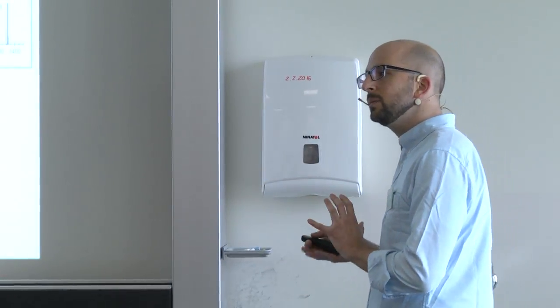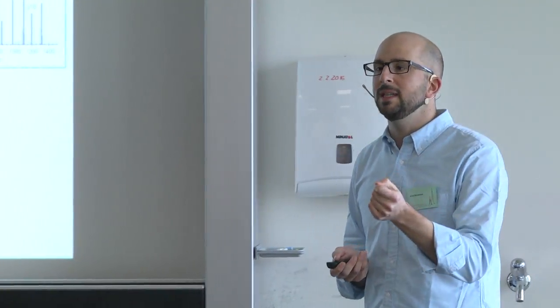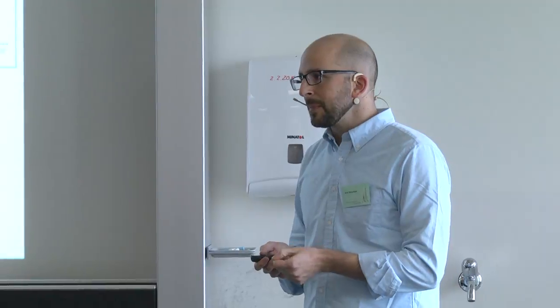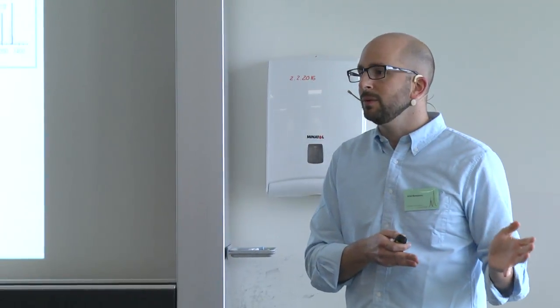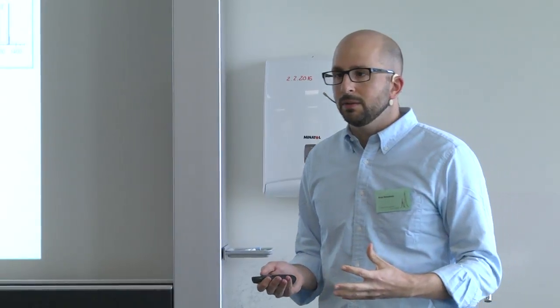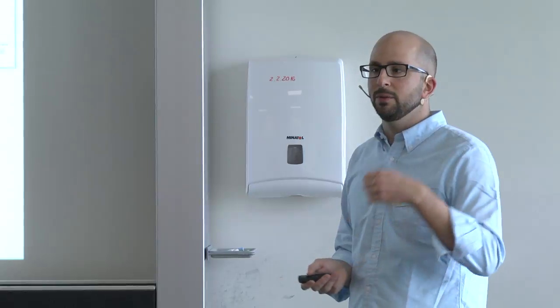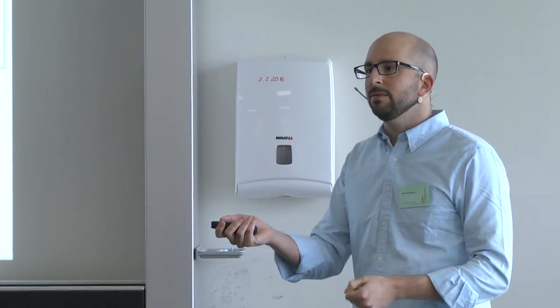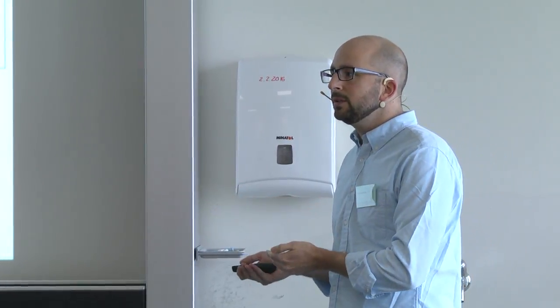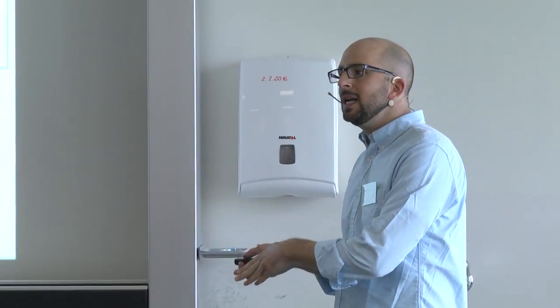So in tutorial 2 we gave you a library. You saw that the ending was SPTXT. So this library was prepared by someone in advance, and then you just needed to upload the library and use it. And tutorial 3 is aimed for you to learn how to build your own library. So you take some search results, you take some files, and then you put some filters on them, and what you get at the end is a library file which is inside Skyline, and then you can use it.